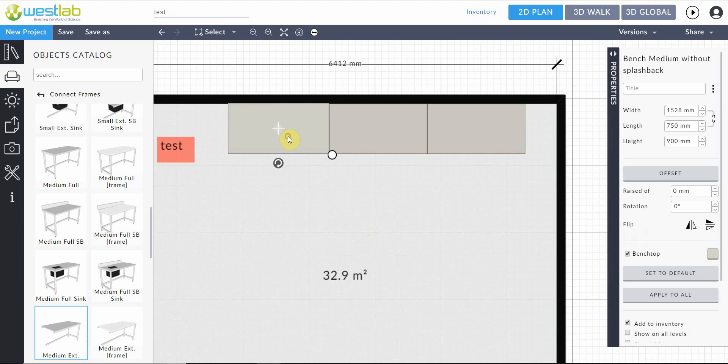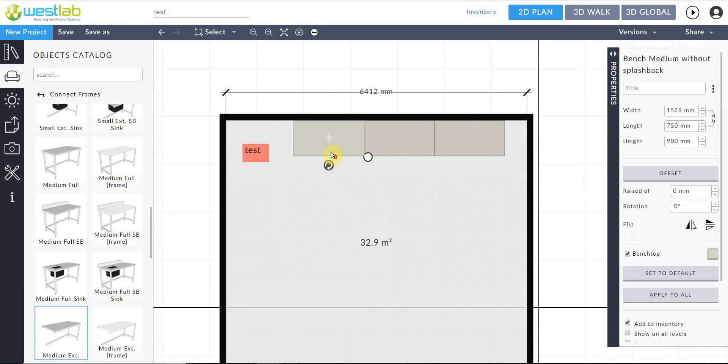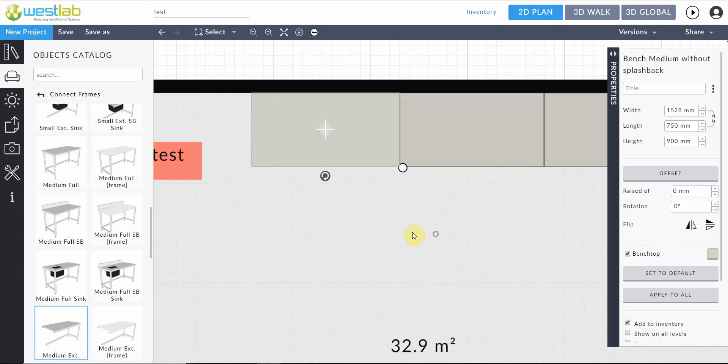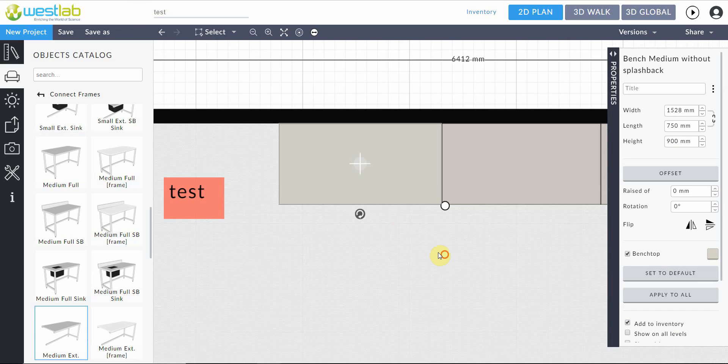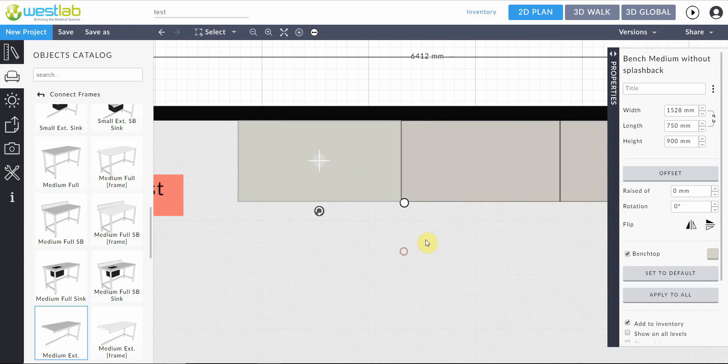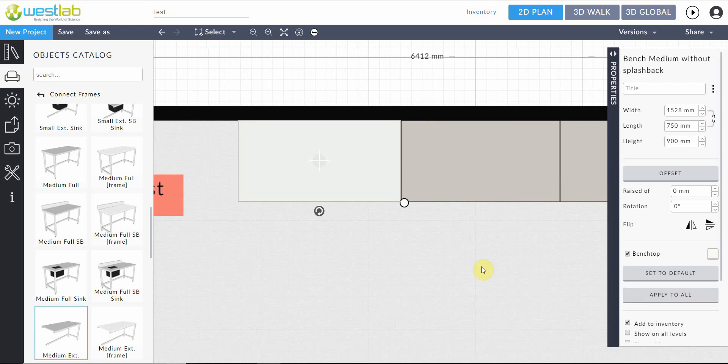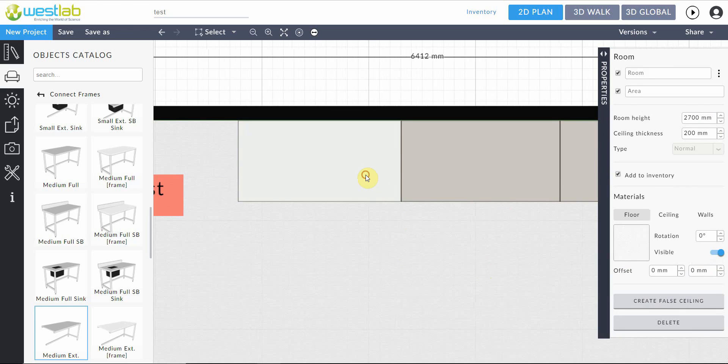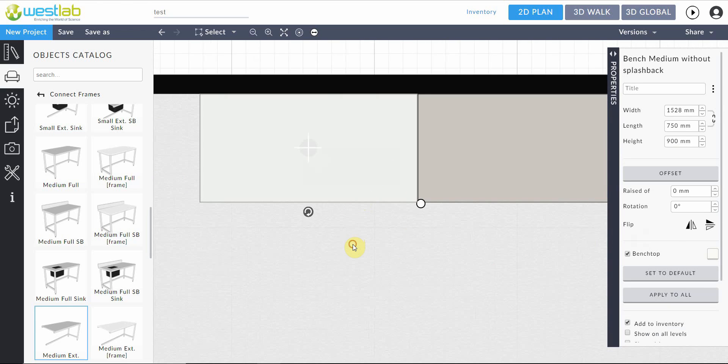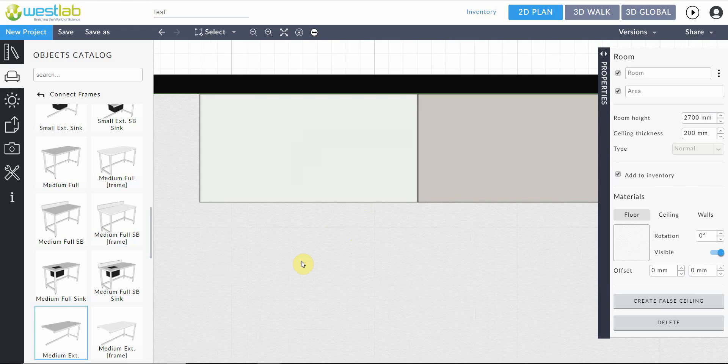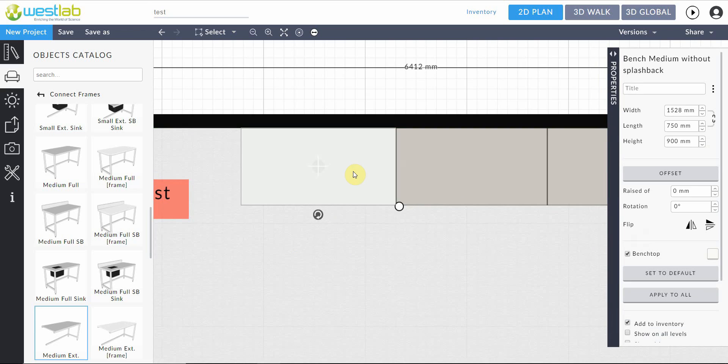So when we select something in our drawing space, this will bring up the properties of the tool that we've selected. So here we can change the color of the benchtop or the material. Here if you hover over one it will give you the material name. So we'll just change that to the white color for example. Other options. So this first bit is the dimensions.